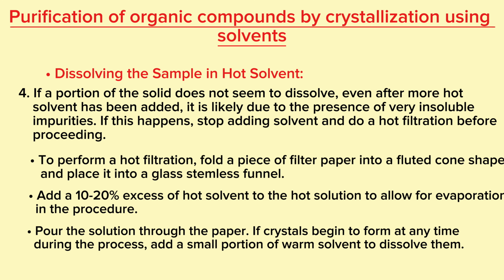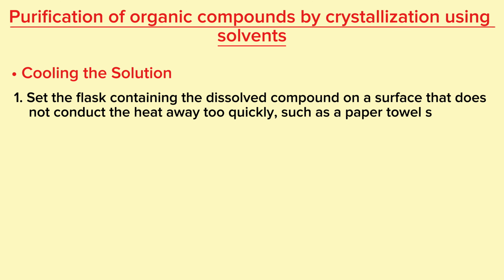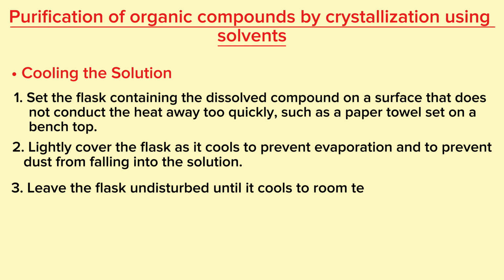Cooling the solution. Set the flask containing the dissolved compound on a surface that does not conduct the heat away too quickly, such as a paper towel set on a benchtop. Lightly cover the flask as it cools to prevent evaporation and to prevent dust from falling into the solution. Leave the flask undisturbed until it cools to room temperature.